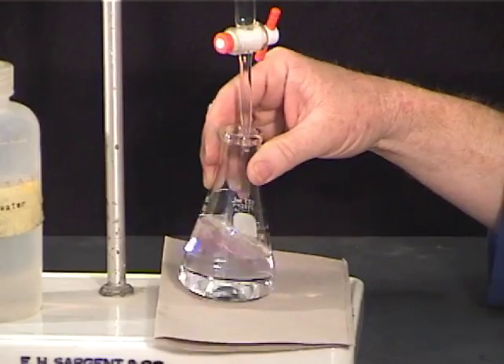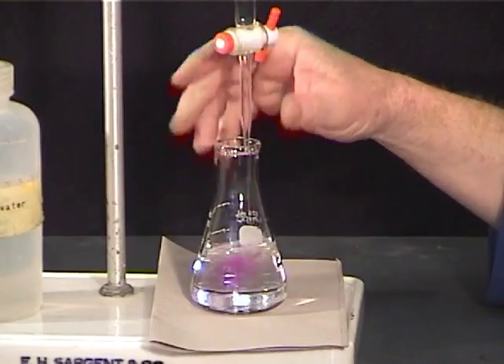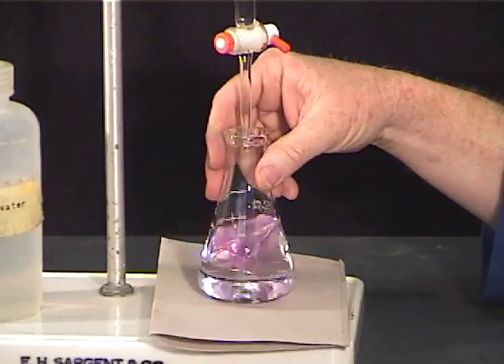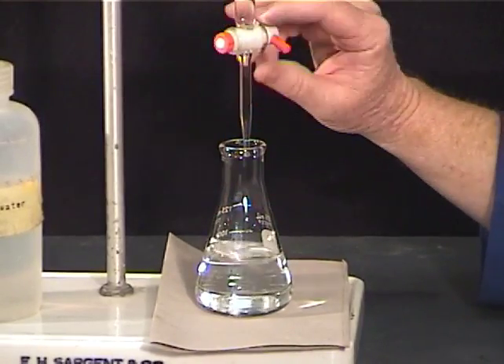Slow down the titration when the color change becomes more pervasive and begins to linger throughout the flask. Add the titrant dropwise at the end.